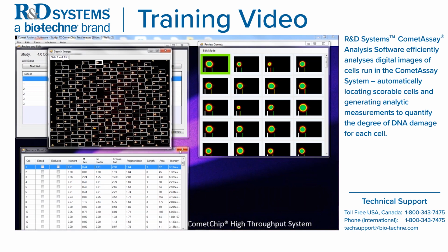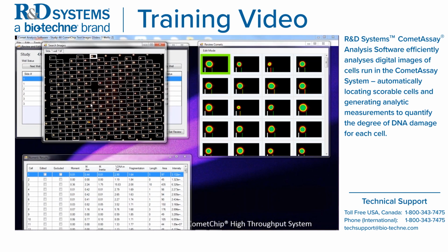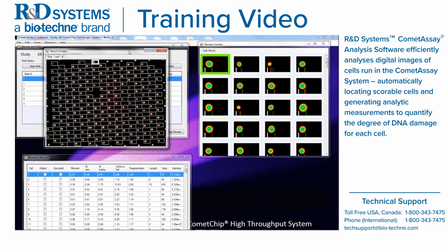So if you are going to edit, I strongly recommend first starting with the search image window. This is the search image window. All of these are scalable, so you can always expand it to full screen if you want, or you can put it right back down to size. For the CometChip, it's nice to scan down and make sure all the comets that were selected are still in the array panel, within the micropore. So all these look pretty good. So that's the first step.